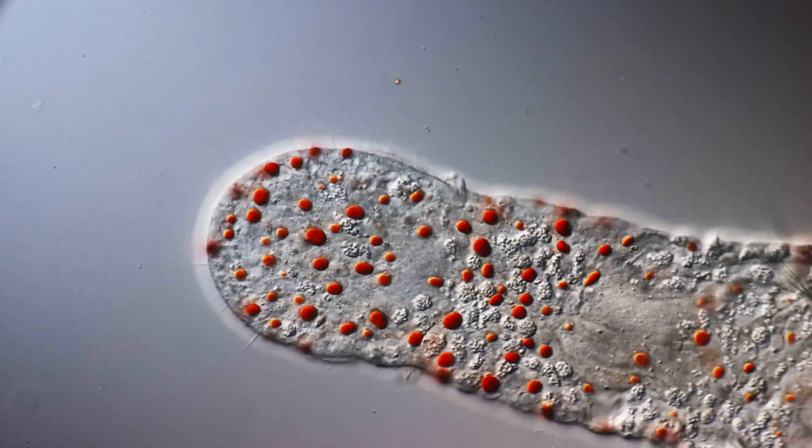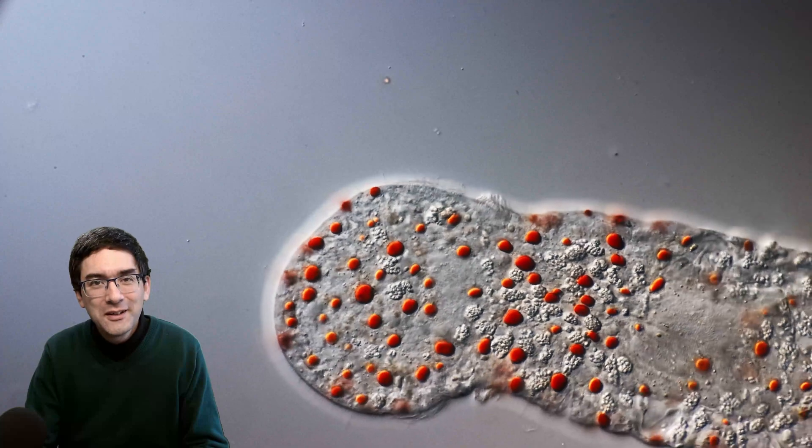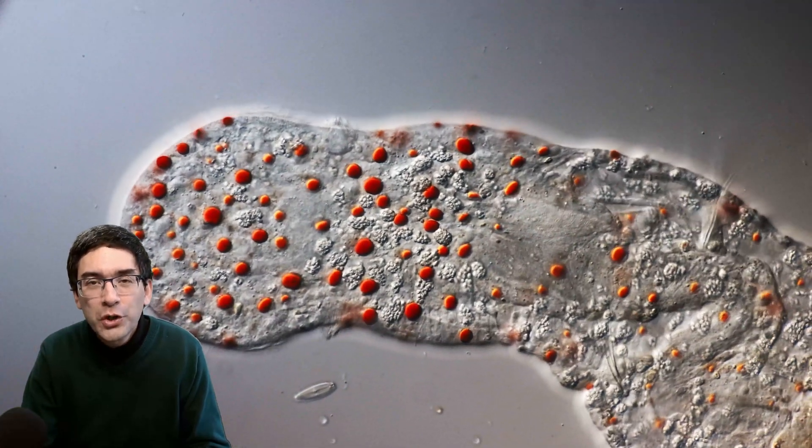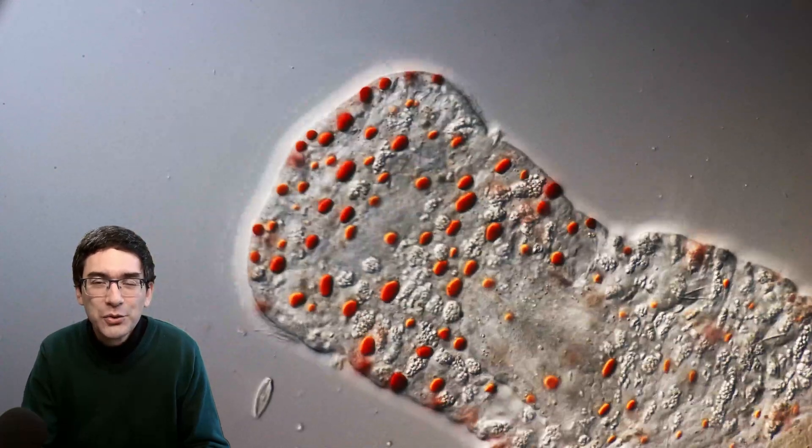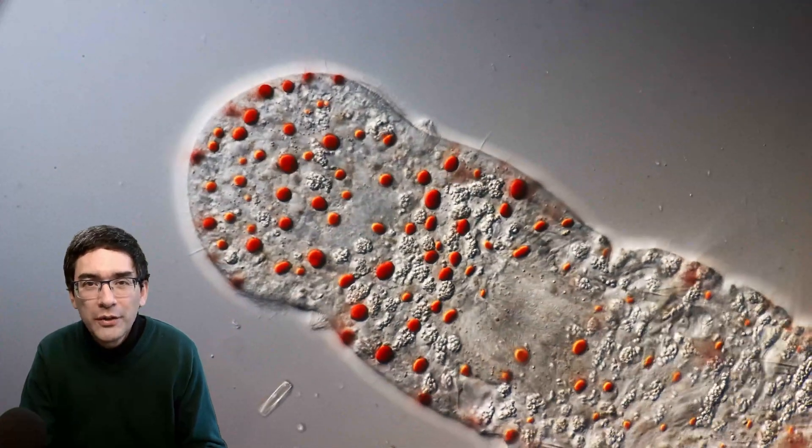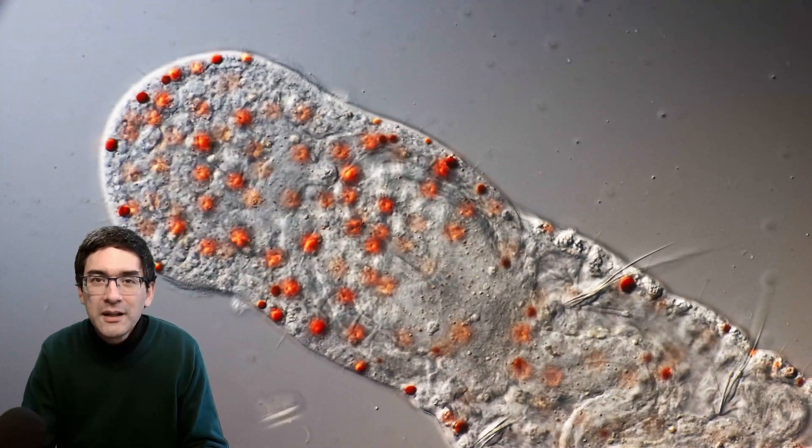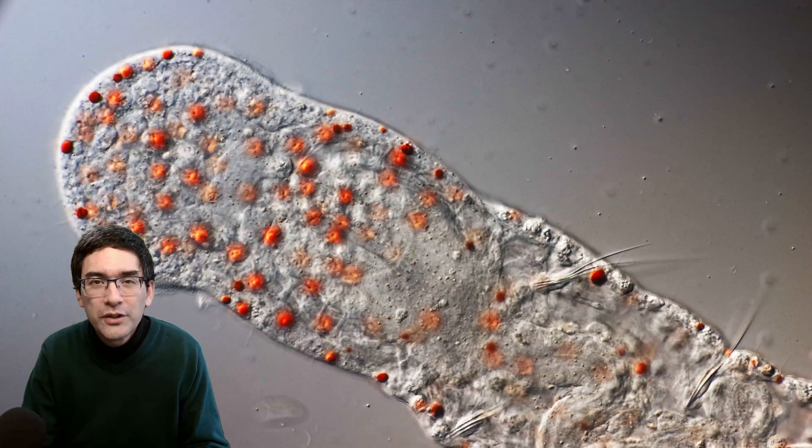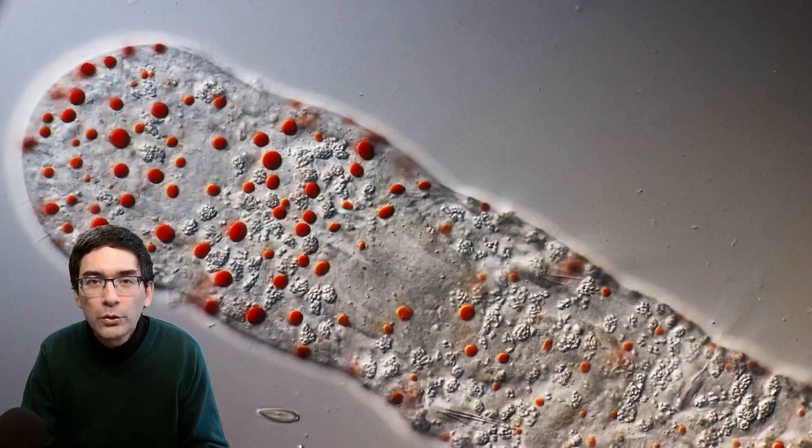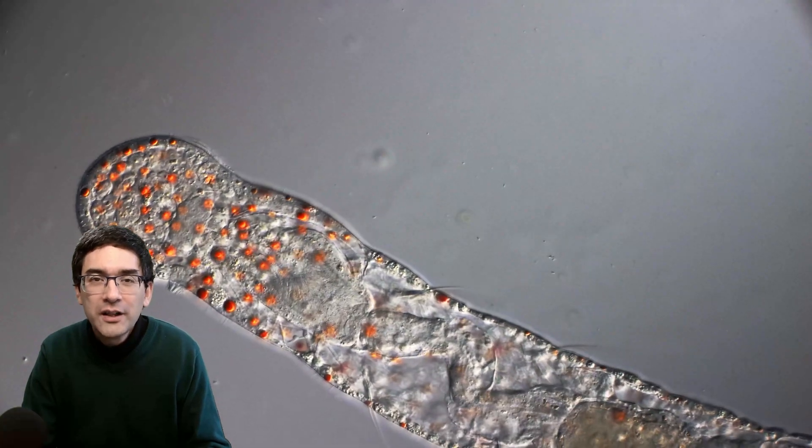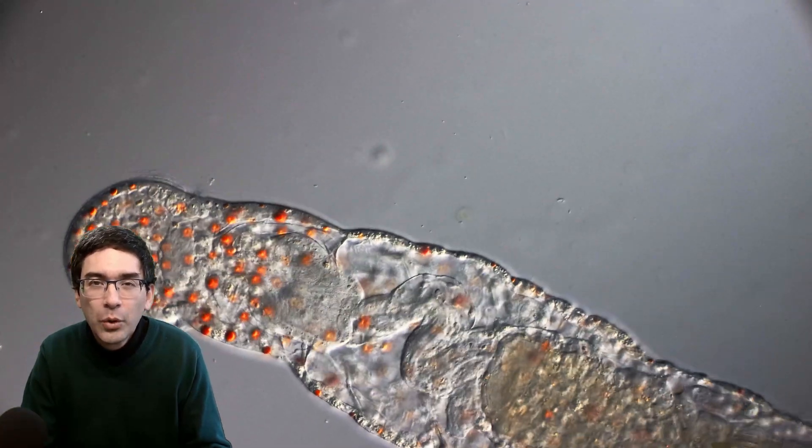There is one typical characteristic of this worm, and that is those orange-red round structures that you can find. In many cases, those round structures are on the head of the worm, but in some species they're also scattered throughout the body. Those round orange structures are called oil globules or oil droplets, and they are actually what give the worm its name.